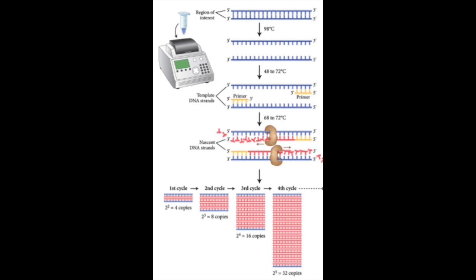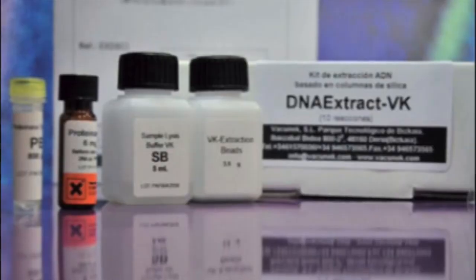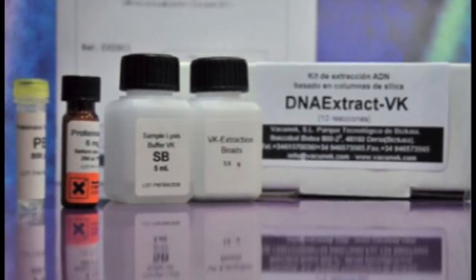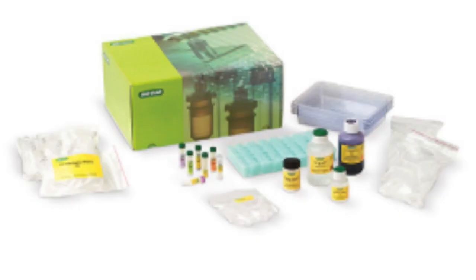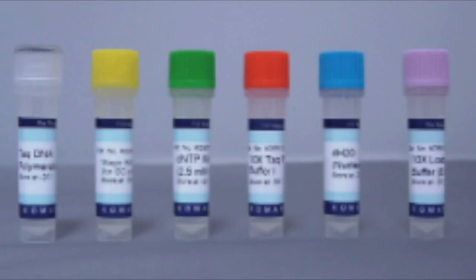Also, when preparing the PCR reaction, the amount of polymerase, dNTPs, buffers, and primers should be added according to the concentration of the sample to be amplified. Before starting the PCR reaction, parameters such as time, temperature, and number of cycles need to be established according to the enzyme used and the primers added. If a PCR cycle is set without considering this, it will most likely fail.